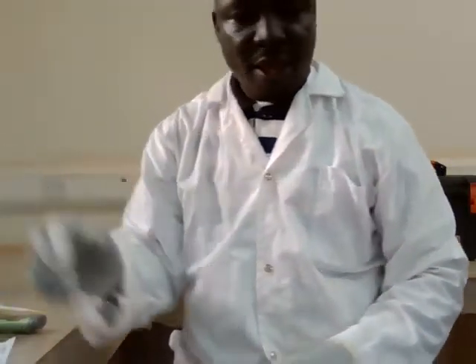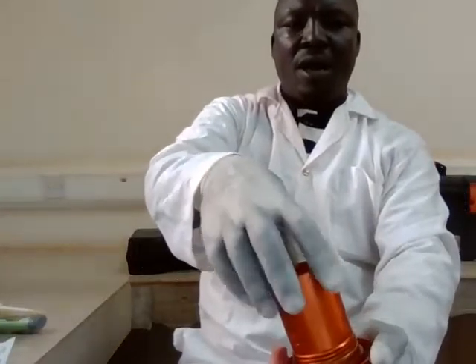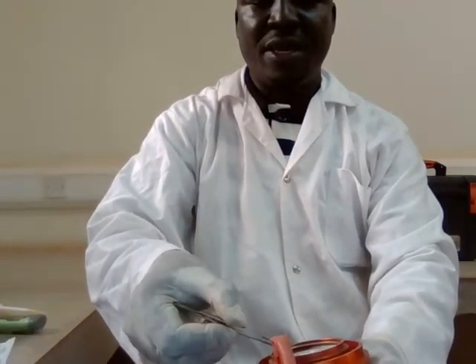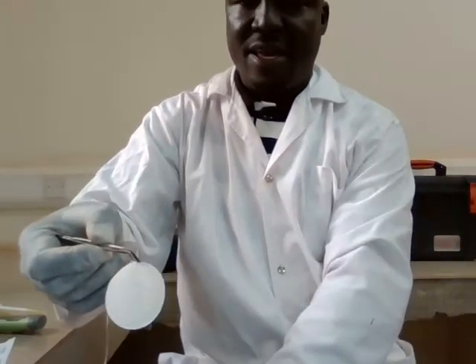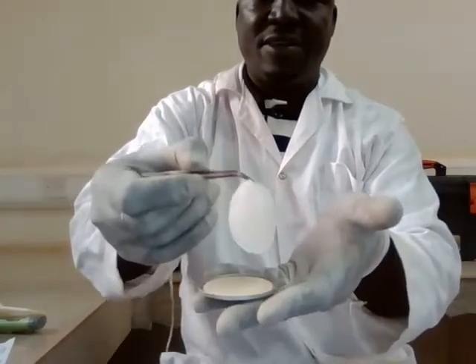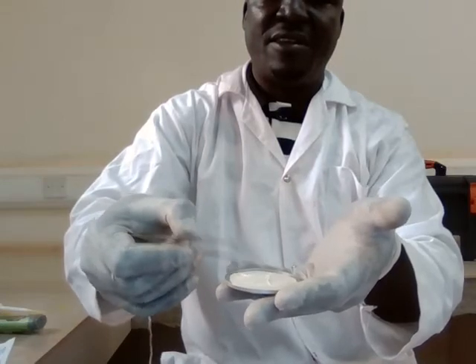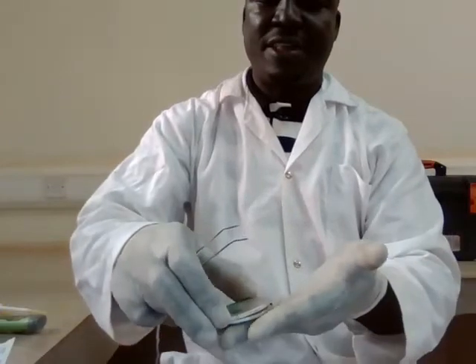Okay. Now you will open up what you have filtered using the sterile forceps. You first sterilize it and then pick it on one side like this. Then you place it on the surface without touching it with your hand. Okay, and then immediately cover this.